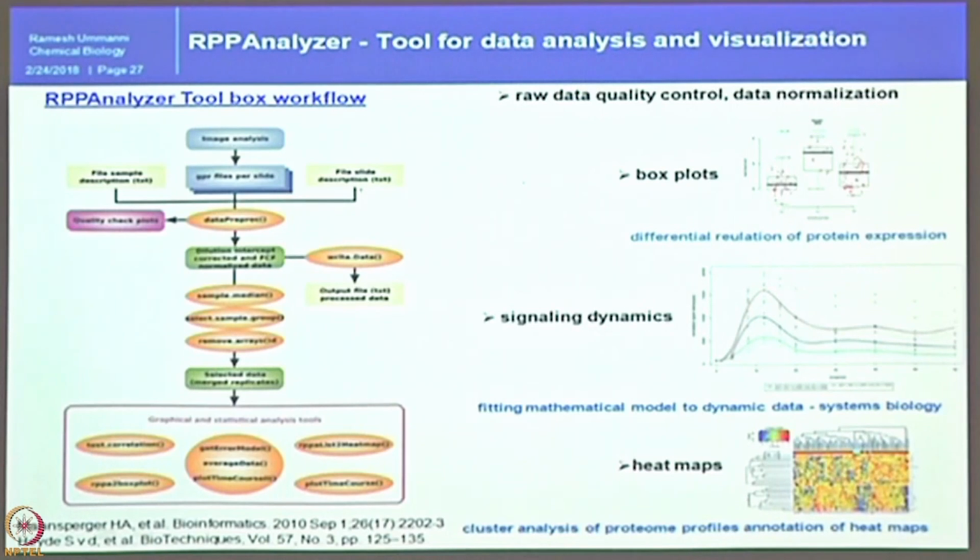The processed data will be here, and then the software automatically looks for quality controls, meaning whether a blank signal is really a blank signal, the signal is really signal, what is the difference between blank signal and the real signal, and it will also calculate the signal to noise ratio, and if necessary to drop some of the arrays, it will suggest what to drop, what to include, then we can proceed further.